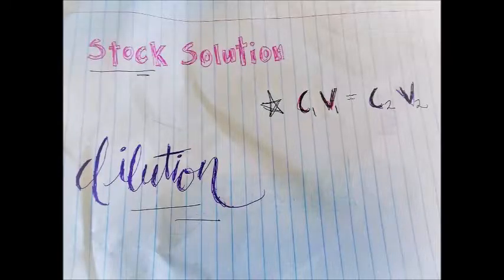In this experiment, we are dealing with stock solutions and dilutions. Dilution is creating a less concentrated solution made from a stock solution. And a stock solution is a solution that is prepared that you can make solutions of lesser concentration from it.